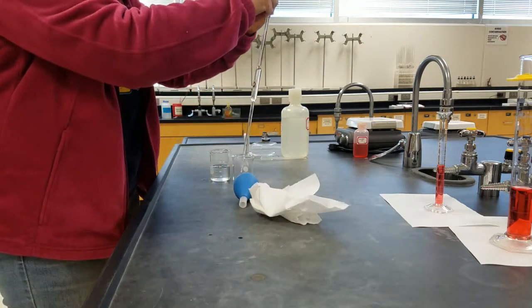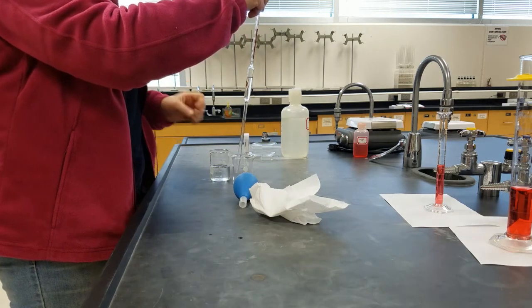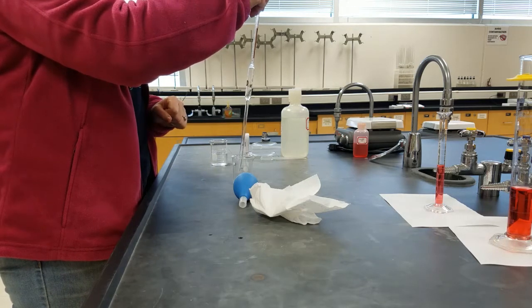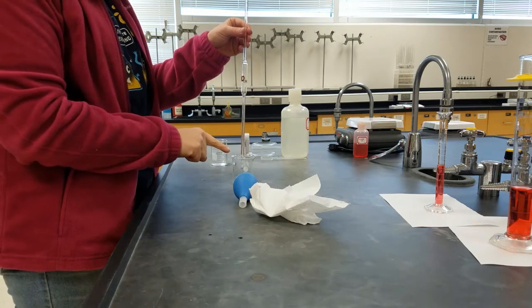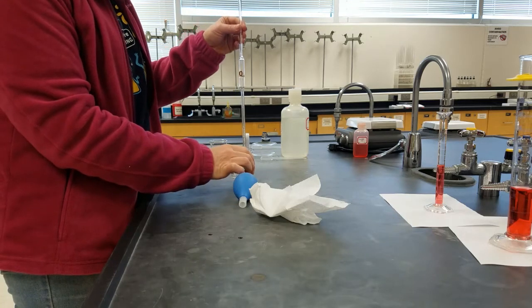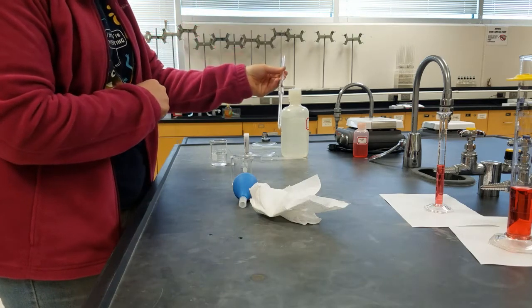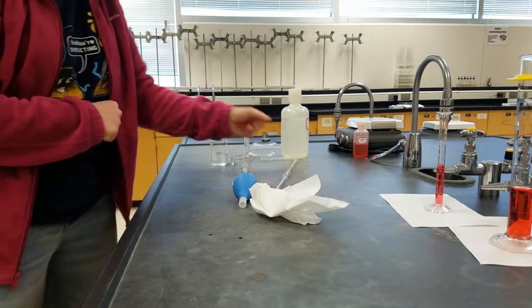And then allow the liquid to be released into the beaker that we have weighed and we know the mass of. We allow it to freely drain, and you never blow out the last little drop. You want to touch it to the side of the beaker to make sure that as much has been removed as possible, but there's always a tiny amount that's left in the tip, and the pipette accounts for that amount.